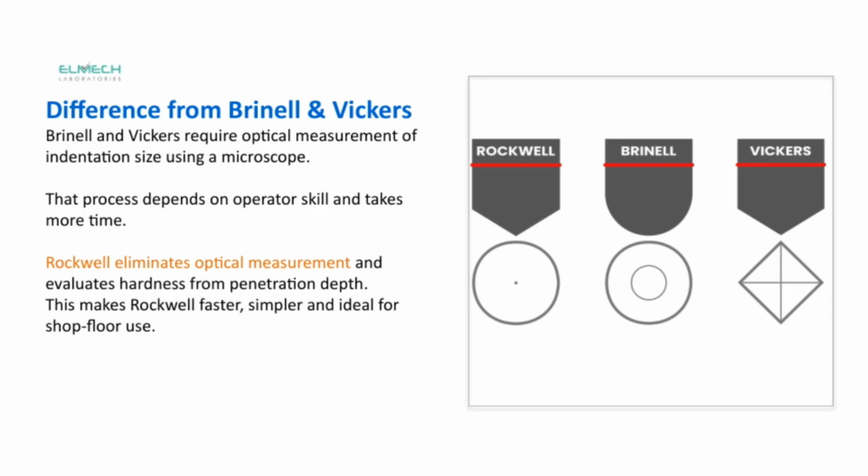Instead of optical measurement, it evaluates hardness based on the depth of penetration of the indenter. This approach eliminates the need for optical measurement, making the process much faster and easier. It's especially well suited for shop floor environments where speed and simplicity are key. So, overall, Rockwell offers a more efficient, straightforward method that can be easily integrated into production workflows.